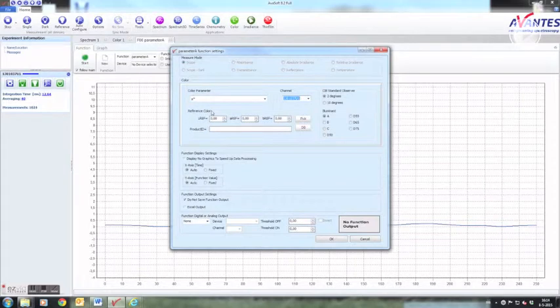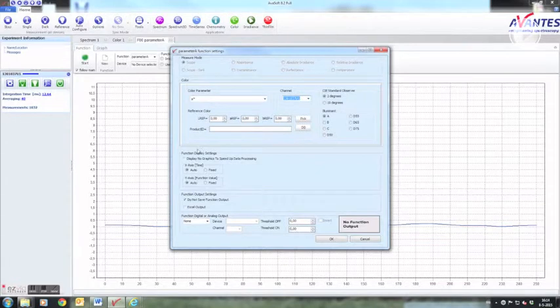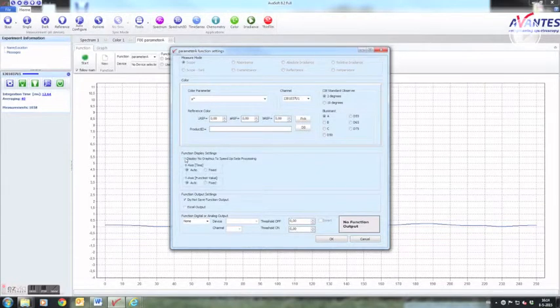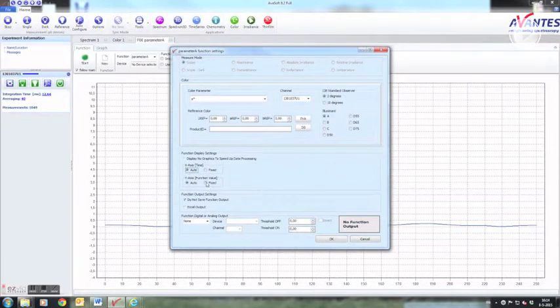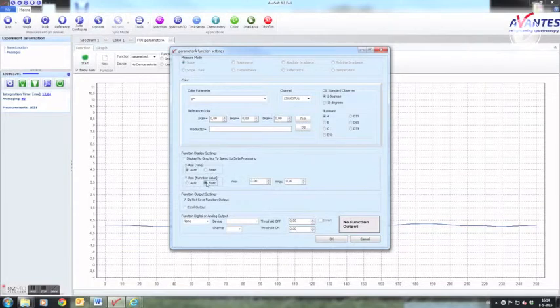And the observer and illuminant settings are assumed to be right. With function display settings you can switch off the graphics to speed up processing and you can fixate the X and Y axis. By default these are autoscaling.